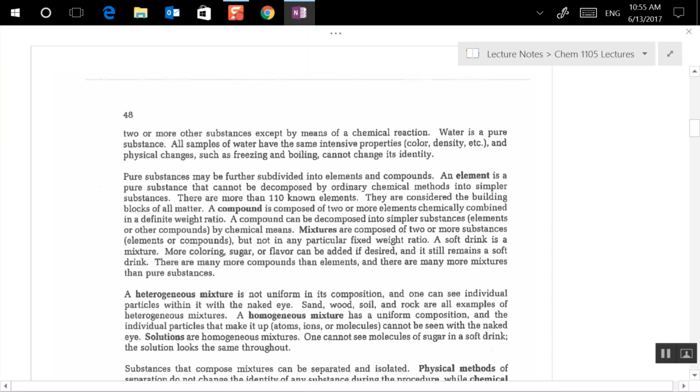Let me look at the list. Okay, you're going to have, yeah. We're not going to be doing mercury, so you can cross that one off. Don't worry about mercury. We will have magnesium. Okay, we're going to look at iron, sulfur, magnesium. All right, we're going to determine some of the characteristics of those things and identify some of their physical properties.